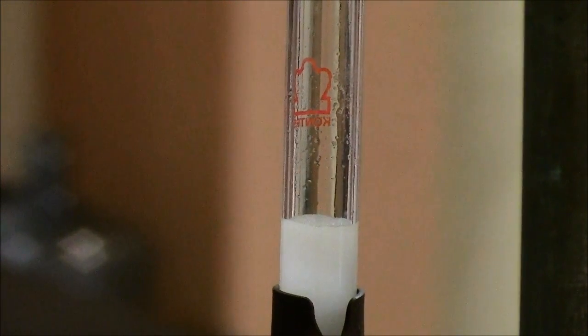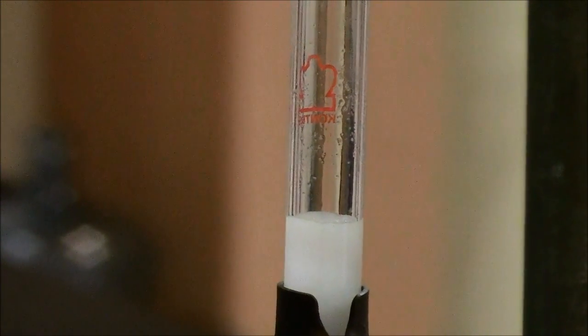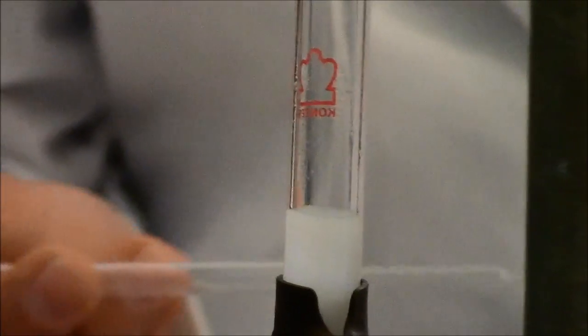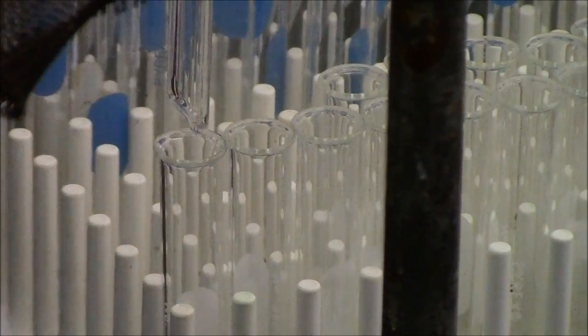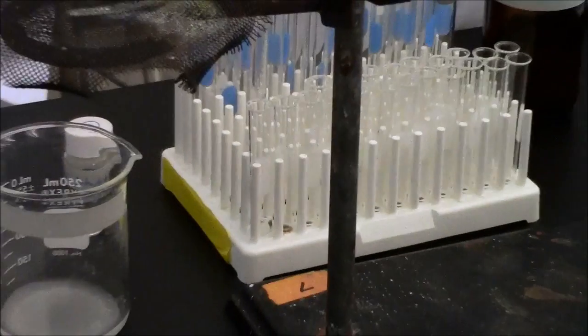Okay, great. So now you should be able to load a bigger solvent on the top, and you start collecting fractions seriously. Yeah, because you said the first one won't have anything in it. So the first one could be a big fraction. Like, I mean, most of the test tube. It could be half a test tube's worth, yeah. Sure. Okay. That would be a reasonable thing to start with.